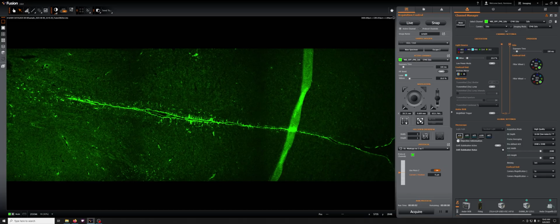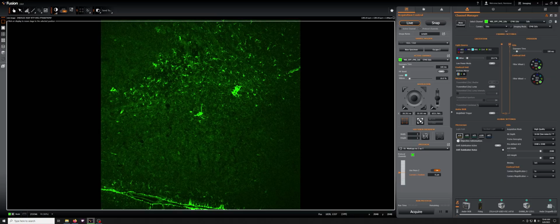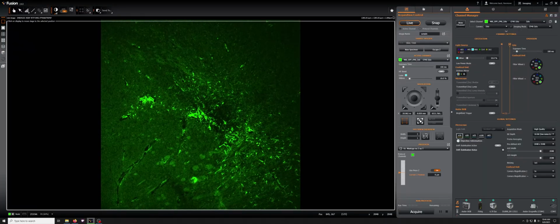If you activate this such that it is orange and you press anywhere in the image, you will navigate to that location in the image. That can be an image that you have saved, and it can be a map like this one. So if I click here, it will center what was there, this object. You can also do this when you're live on the image you are on, and just click and navigate as you click around. So that has the same functionality as before.